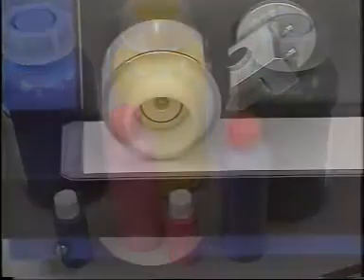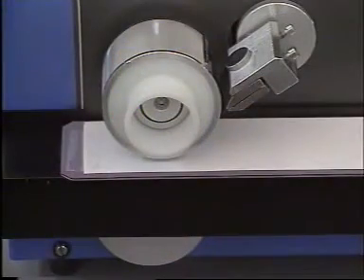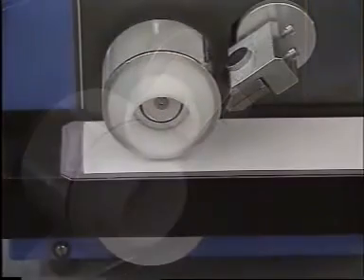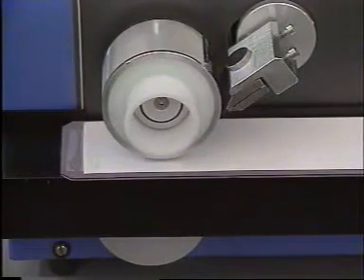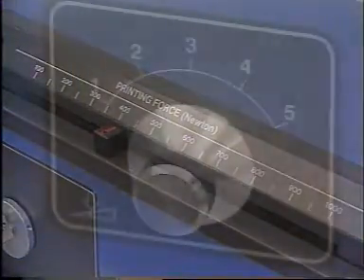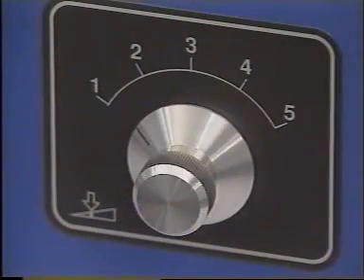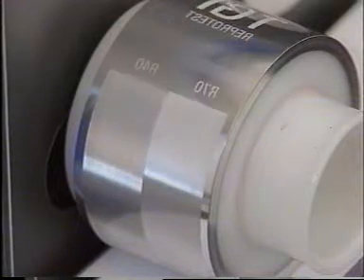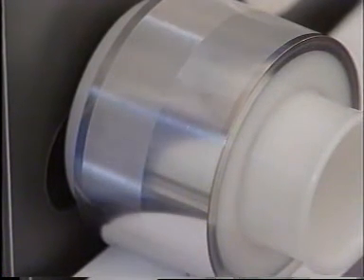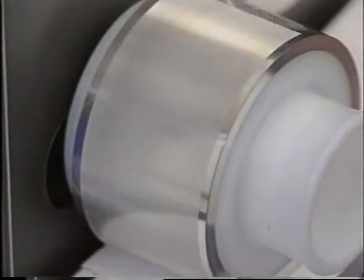The G1 functions like a printing press, with an engraved printing form, printing disc, a doctor blade, the substrate and an impression cylinder. The printing force can be set between 100 and 1000 N. The printing speed can be set between 0.2 and one metre per second. The printing discs are electromechanically copper engraved and chromium plated, and are available in various patterns and with several screen rulings.